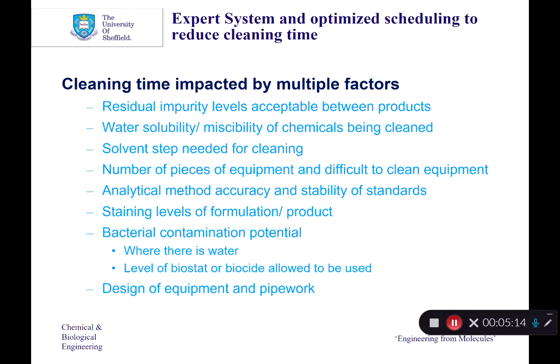So the microbubbles show that we can make a huge difference on cleaning times and cleaning quality, which can give improved accuracy and also reduce the time of analytical work that needs to be done, because you can be more sure of the cleaning. So when you take that into account, and you take into account the different factors that can impact cleaning, you can put that into an optimization system.